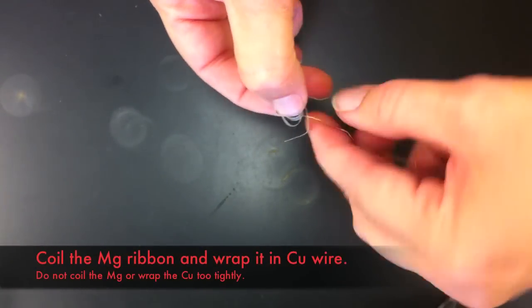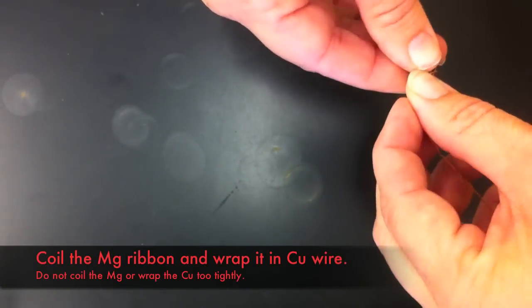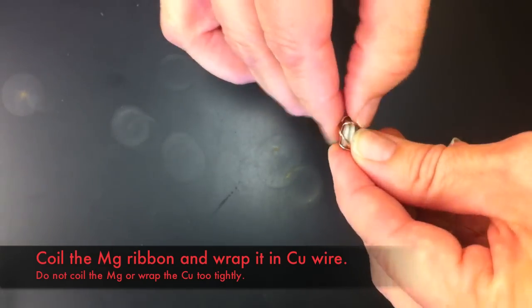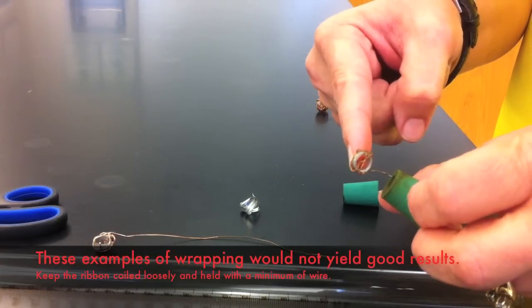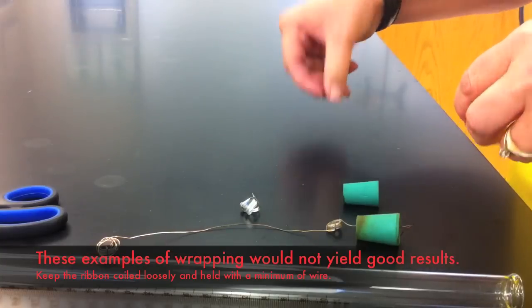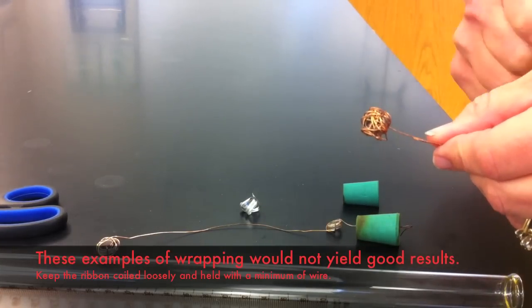You will need to cut a length of magnesium ribbon about 9 to 10 cm long. Wrap it into a loose coil and then wrap that coil within the copper wire to make a loose cage to hold the magnesium ribbon in place. Winding the magnesium ribbon too tightly or making too large a cage with the copper wire will lead to inexact results from your experiment.